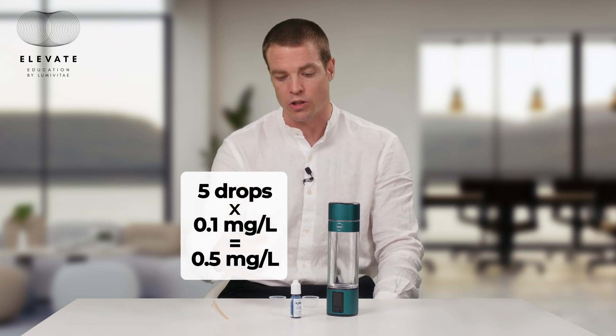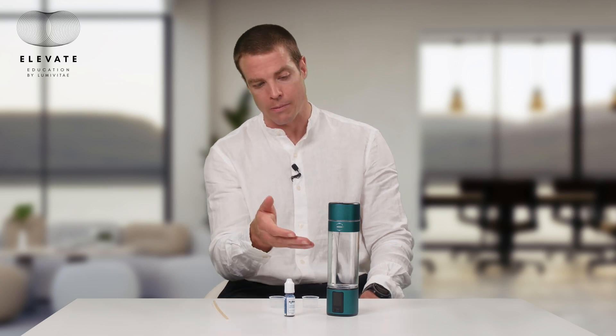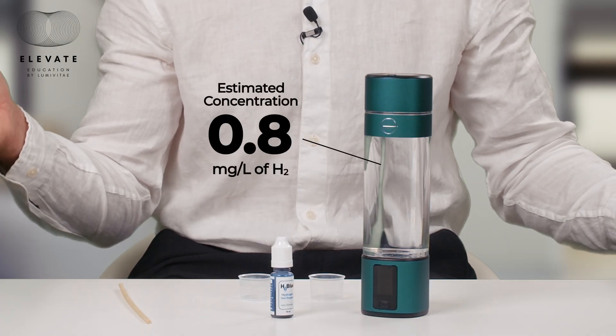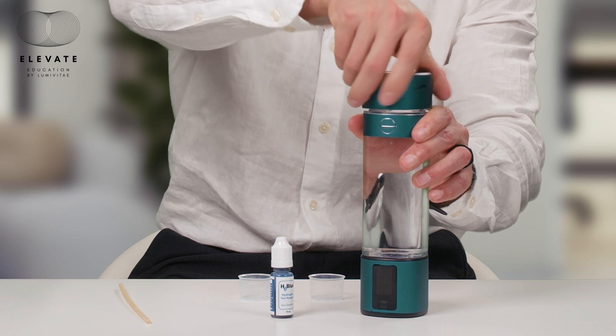A lot of people will try to use this reagent and they add it correctly but they don't use it correctly. I'm going to show you a demonstration of how to use it correctly and not correctly. We just made some hydrogen water — I'm guessing the concentration is around 0.7 to 0.8 milligrams per liter. As soon as I open this bottle, the gas starts to come out immediately. So we want to be quick — we don't want to sit here and talk for a long time without testing because the concentration is going to be lower. I'm teaching you what not to do.